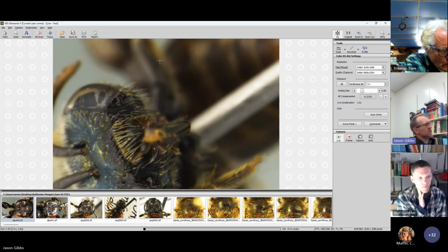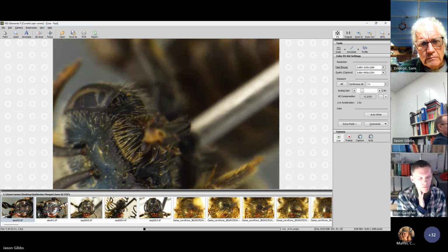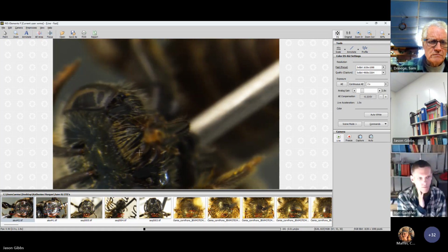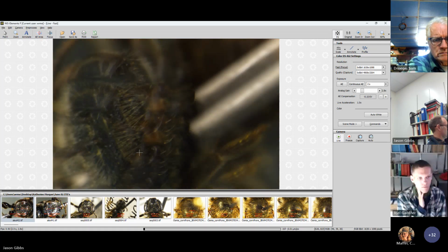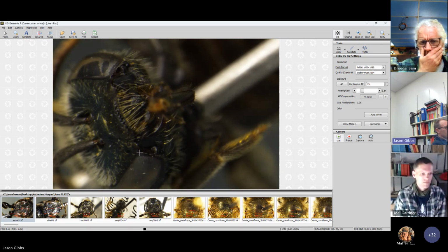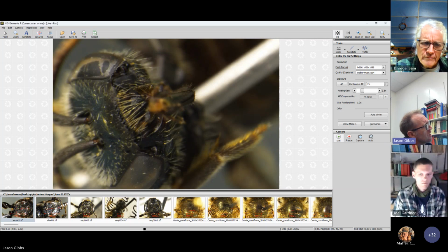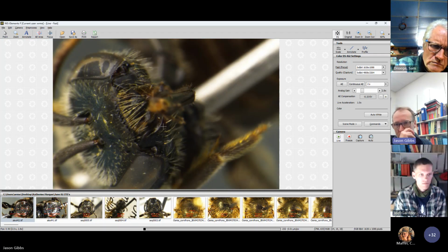And I think I might be able to, without changing the view, give you a sense of the mandible. You see in the bottom, I'll try to adjust the light maybe a little bit. A little bit wonky, but you can kind of see, I hope, the base of the mandible here, and there's this kind of curve right here that narrows, and so that character of callidum is also present in connexum.